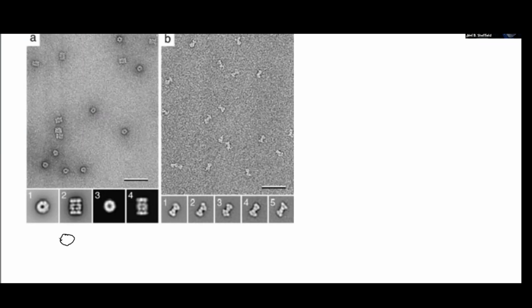a little cylinder. Okay. And a cylinder with a hole in the middle and several different kinds of protein or different structures around the side, like that. And so depending on which way you orient it, you can see it in different perspectives and then try to generate a three-dimensional model of it. That's what's now being done in cryomicroscopy, bioelectron microscopy.